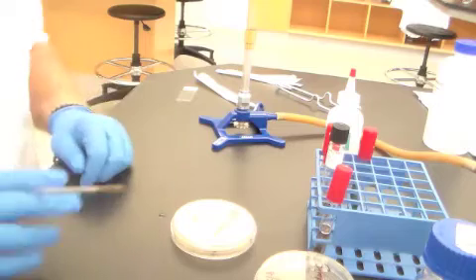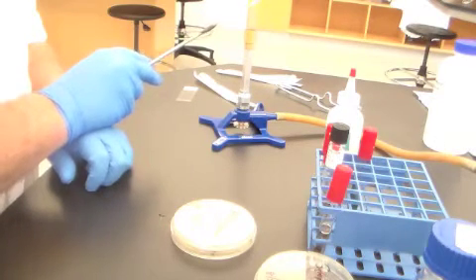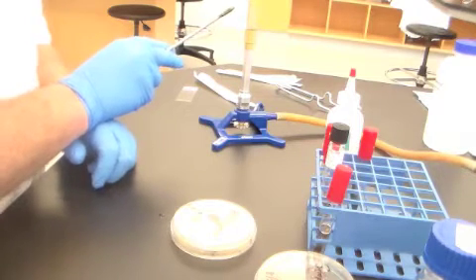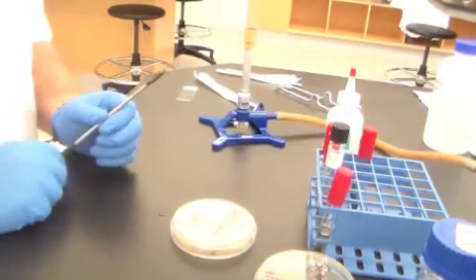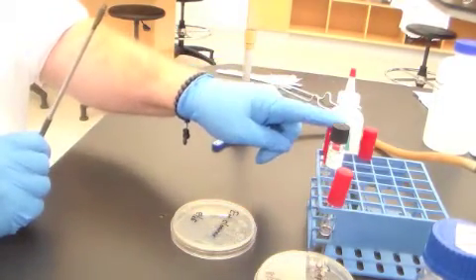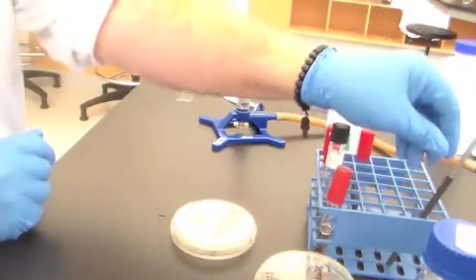They'll all be placed in the 37-degree incubator, and then myself, or more likely one of the TAs, will take them out 24 to 48 hours later and put them in the refrigerator. And when you come back in the following week, we'll record the results of the amino acid decarboxylation tests, indole, we'll do the methyl red test, the Voges-Proskauer test, and we'll record the results of the sodium citrate.